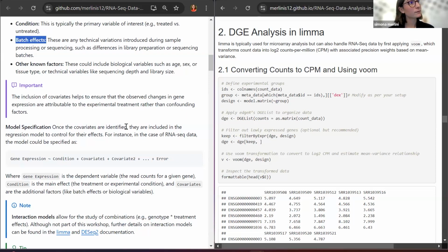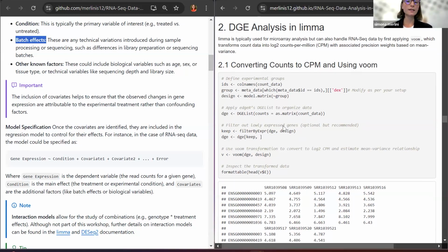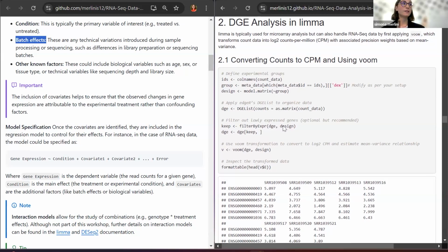In the model for DESeq2 or edgeR, or do they have their own ways of defining the model? So it's almost the same. The only difference is that in limma, you have a variable that is your model variable. So you create your model variable, and then you perform the linear regression saying, use this model that considers these variables. Whereas in DESeq2, you have everything together. So you're performing the analysis, defining the model in the same function that you perform the analysis. Thank you. Sure.